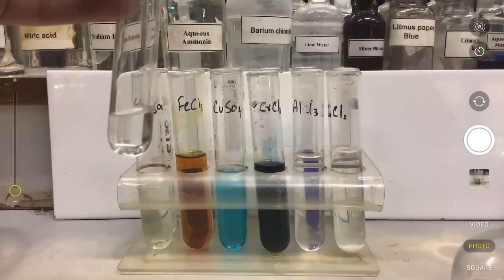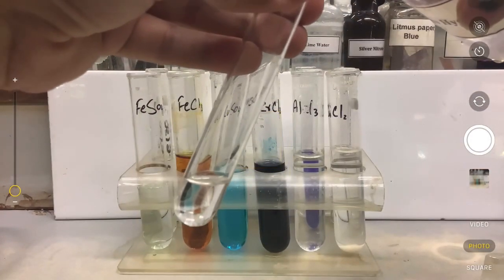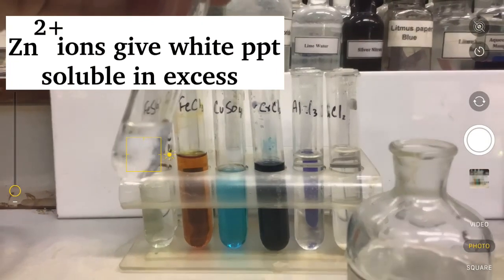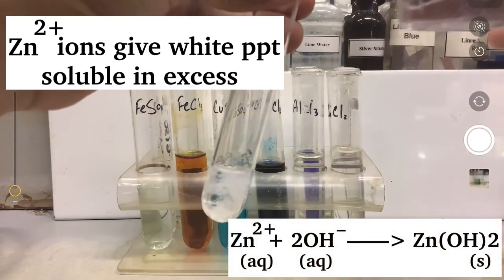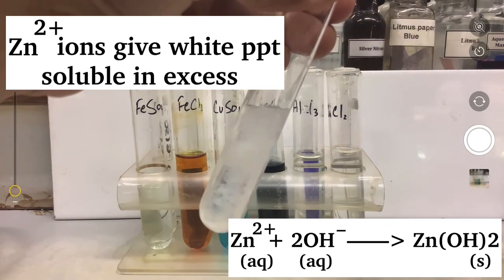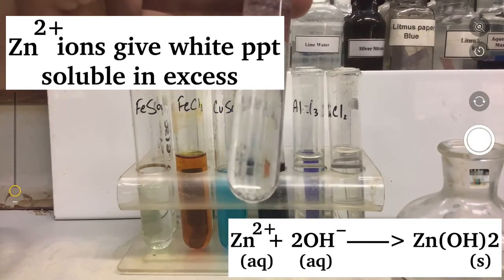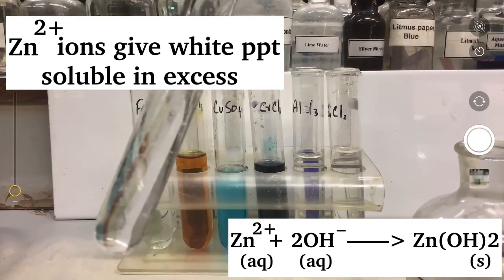The last test is going to be on zinc sample. When I take a sample of zinc salt and I add aqueous sodium hydroxide, I see again sodium hydroxide gave me white precipitates. And these white precipitates look very similar to the white precipitates of aluminium, because zinc hydroxide and aluminium hydroxide gave me similar kind of white precipitates. And as I add excess sodium hydroxide, these precipitates are also kind of dissolving. They take a little time, but they do dissolve, giving me a clear solution.